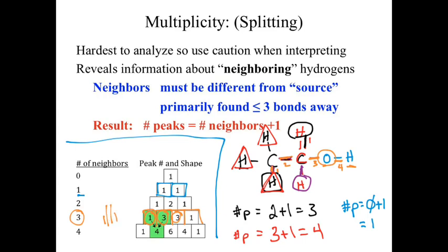So what we end up seeing is something like that. Okay? For our 2 neighbors, it's typically something along those lines. For 4 neighbors, okay, and this pattern continues on. So if we have 5 neighbors, we still get the same kind of pyramidal organization of these peaks. Okay, and yes, we can get up to 8 neighbors potentially.